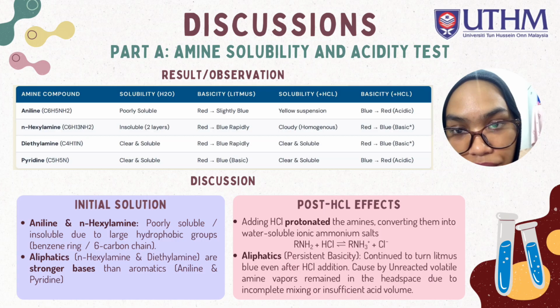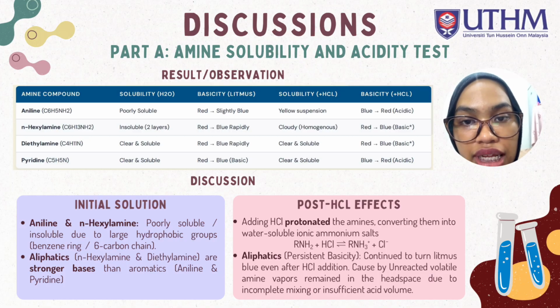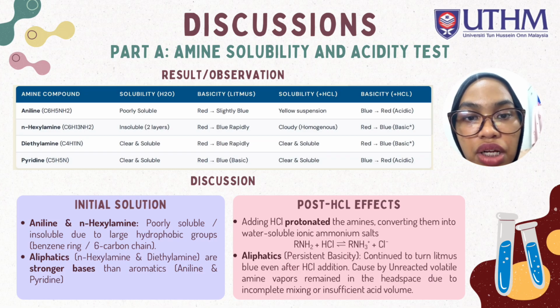The third compound is diethylamine, clear, soluble in H2O. The basicity is red, turns blue rapidly. For solubility in HCl, clear and soluble. Basicity red, turns blue, so it's basic.